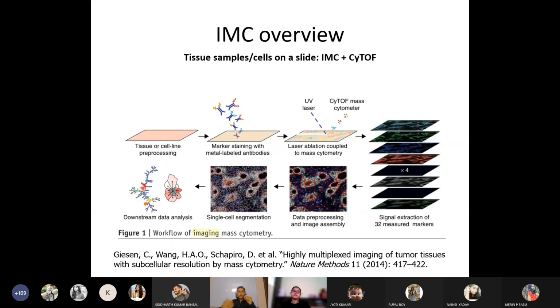If you want to find out more than 32 proteins, you can run different sets of experiments of the same set of proteins. So you can find out even more than 32 different proteins. So it is much less tedious than the fluorescent microscope, which uses 3 to 5 fluorescent tags.